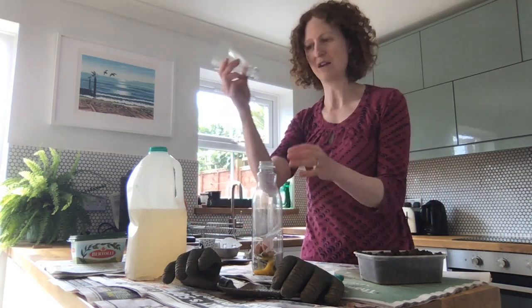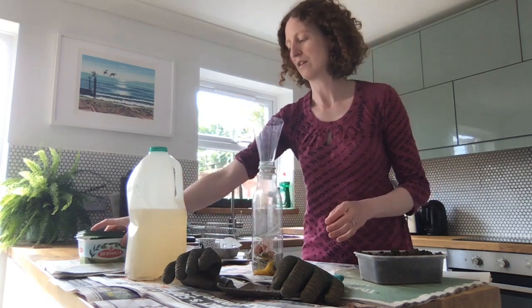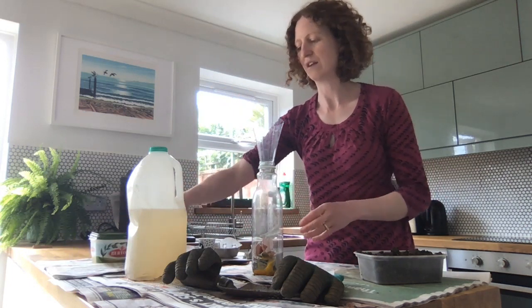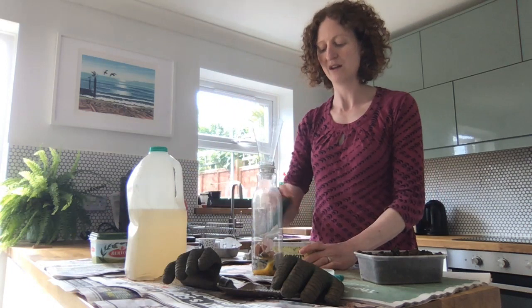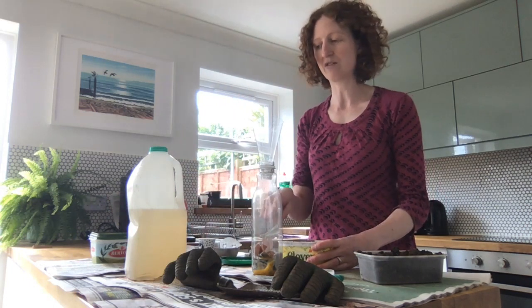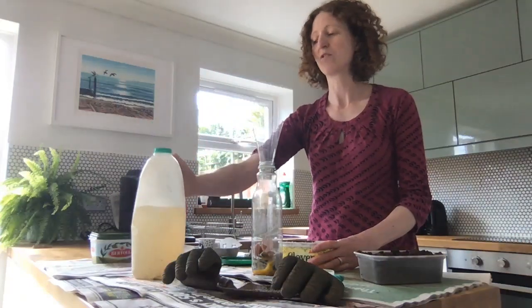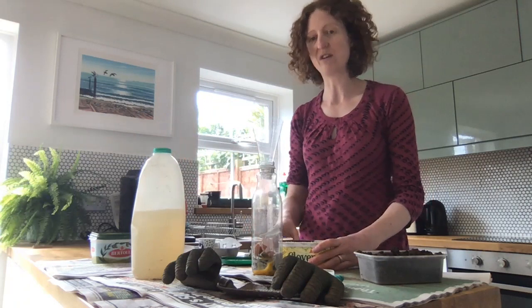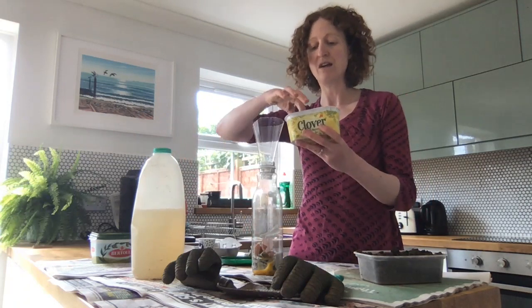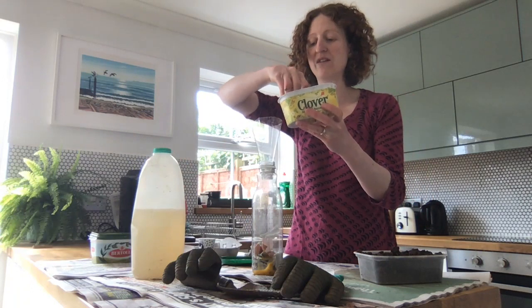And then on top of this, I've just made a funnel from the top of another bottle, and I'm going to use this to help feed in. So this is going to be mud from the bottom of a pond. So this one's soil from the garden, this is going to be mud from the bottom of the pond. And then I'm filling it up using naturally collected water. So it's not tap water, but this is pond water. You can use rainwater or whatever you've got to hand. You can try it with tap water, but you might not get everything growing.